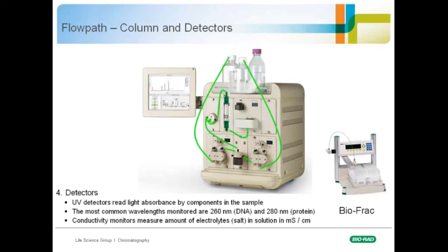You might also see on a chromatography system, next in this flow path, a conductivity monitor. What this does is it measures the amount of electrolytes in solution, and typically you measure that in millisiemens per centimeter.